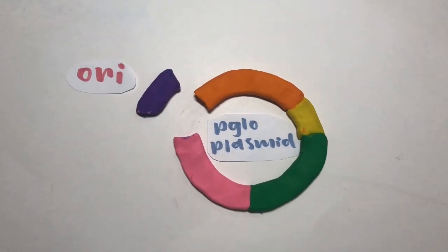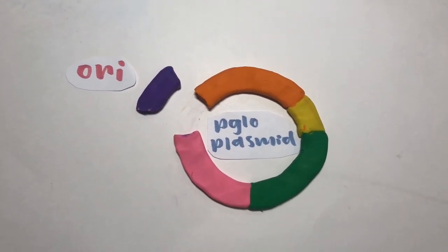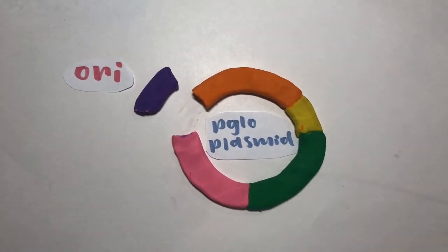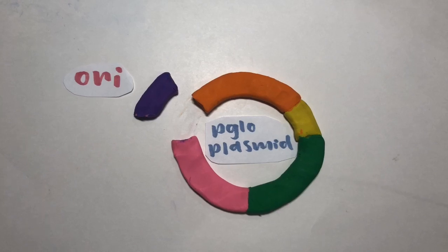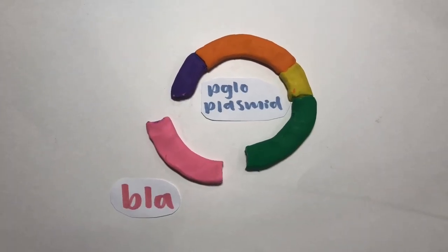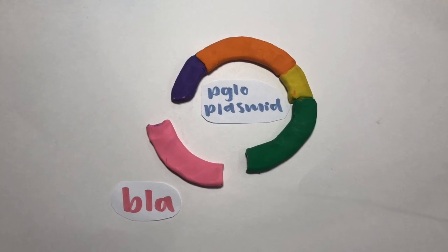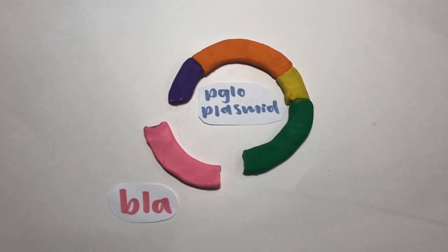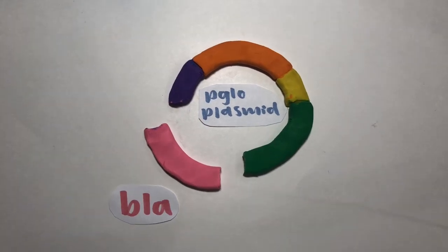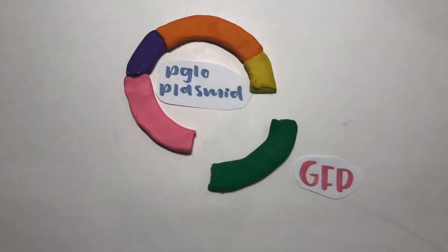So the ORI is one of the non-coding segments on the plasmid. It means it does not code for a protein. It is the origin of replication, where the scissors will come when it's time to replicate. The beta-lactamase gene encodes for beta-lactamase enzymes for antibiotic resistance against antibiotics such as penicillins. This is important because we want the media that we're going to culture our bacteria in to have antibiotics, so we're only growing the bacteria that has been transformed.